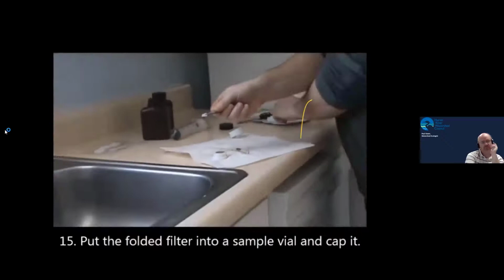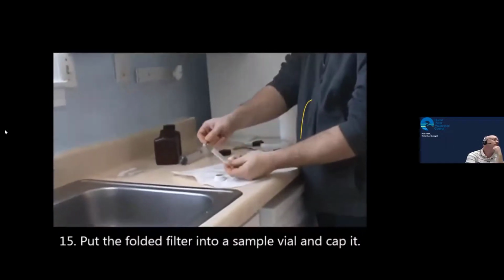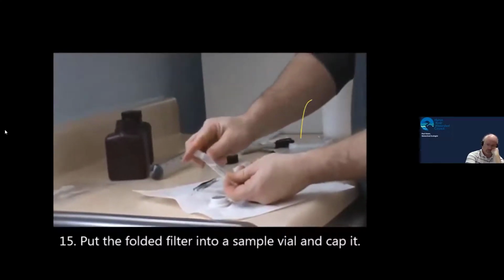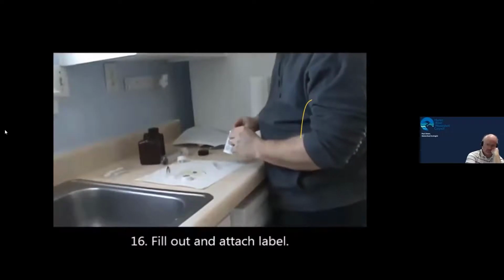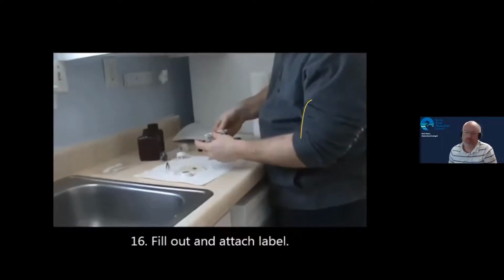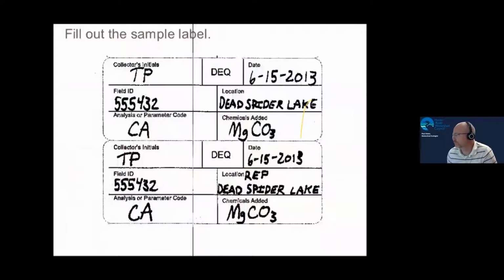Put the folded filter into a sample vial and cap it. Place a filled out sample label onto the vial lengthwise so that none of the label is wrapped upon itself. Let's take a look at what a correctly filled out sample label looks like. You need to use a fine-tipped, permanent black marker to fill out the sample labels.